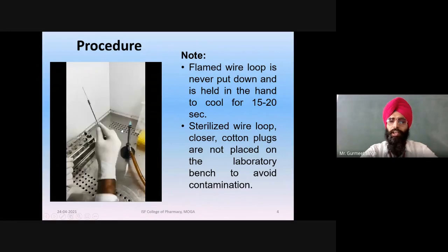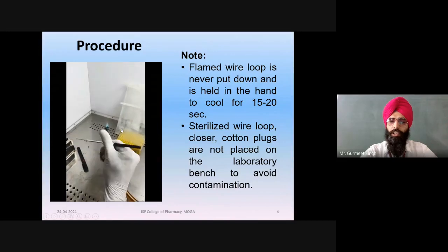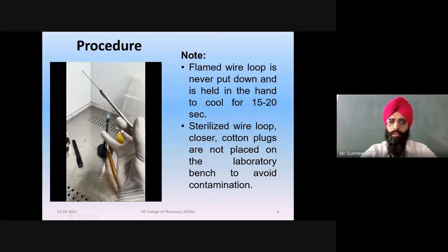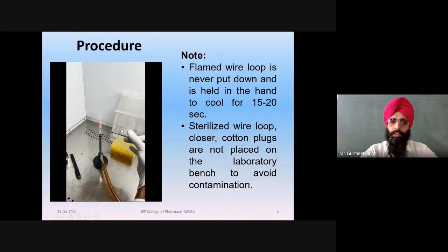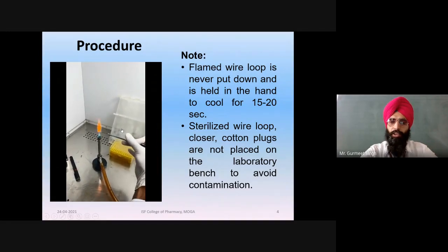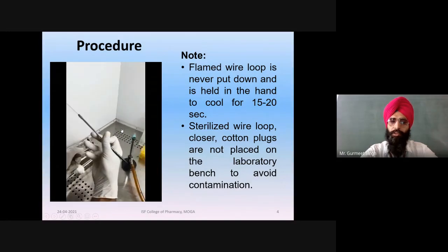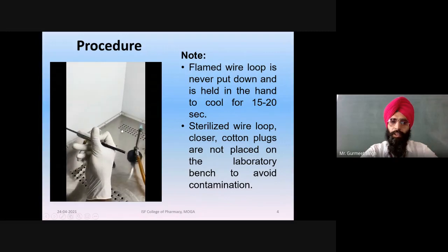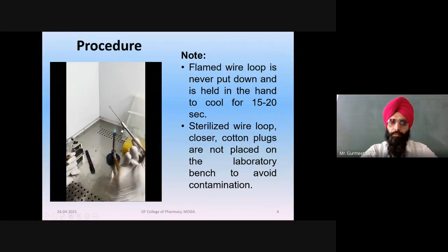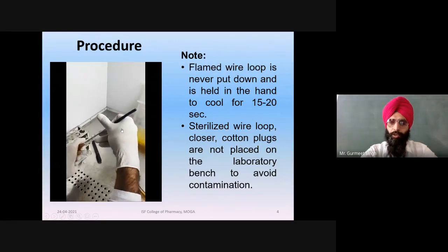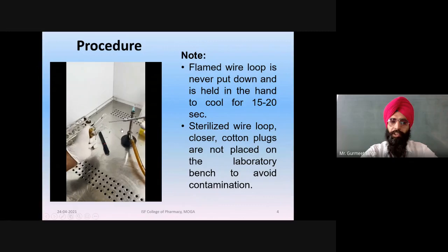Take the inoculating loop in the right hand and sterilize it by holding it in the hottest portion of the flame and heat with the Bunsen burner until the platinum loop is red hot. After that, cool the loop, then open the cotton plug of both tubes and transfer the sample from the bacterial suspension into the nutrient growth media tube.